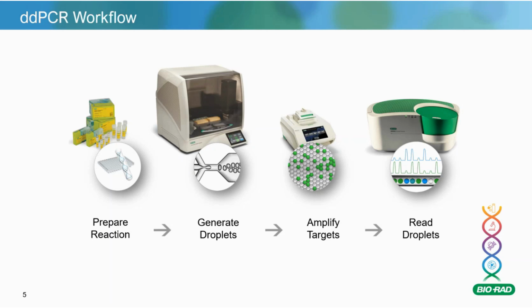And in that process, in the partitions that contain your gene of interest or your target of interest, the PCR reaction occurs, primers bind, it goes through the cycles, and fluorescence increases. For the droplets or partitions where that doesn't occur, they stay unfluoresced because there's no gene of interest.